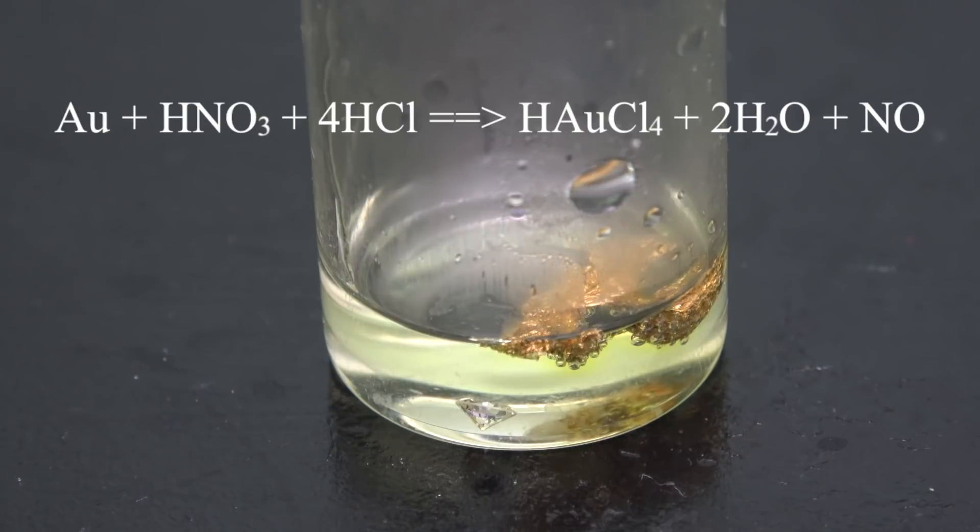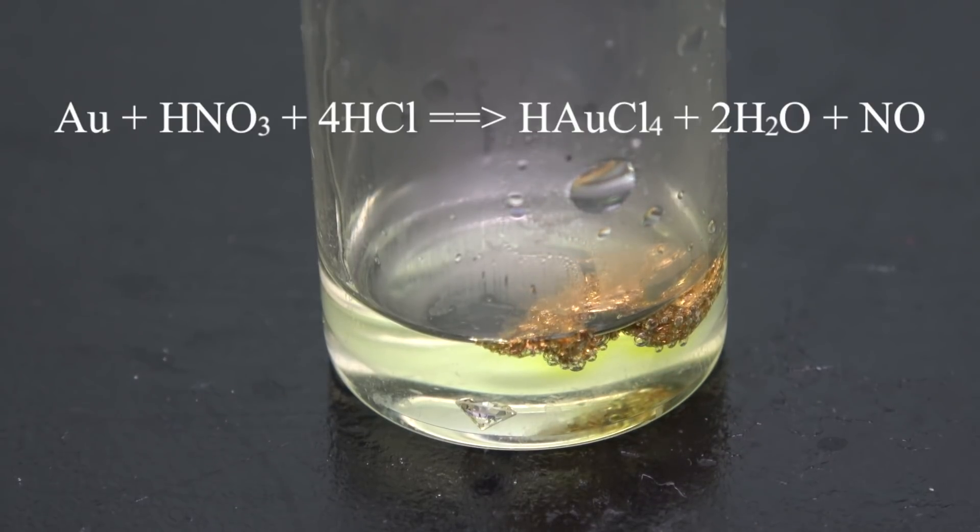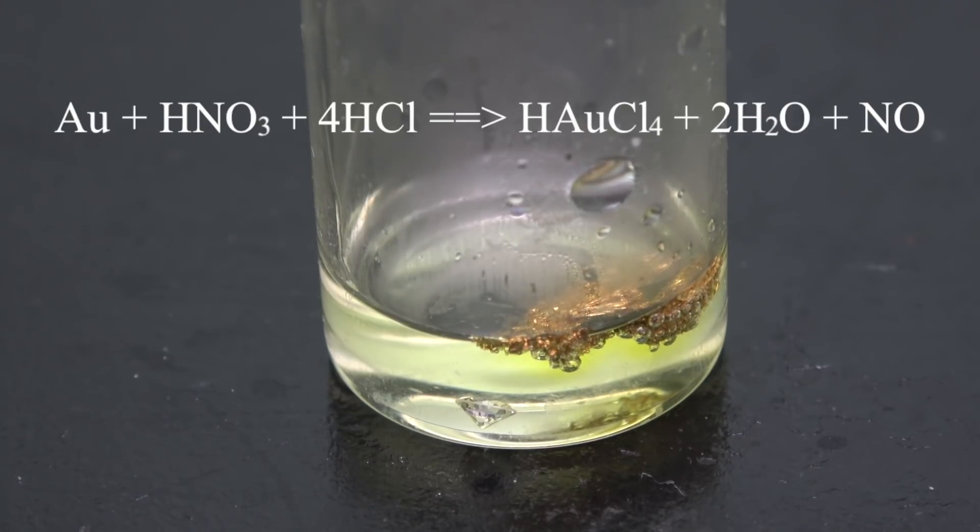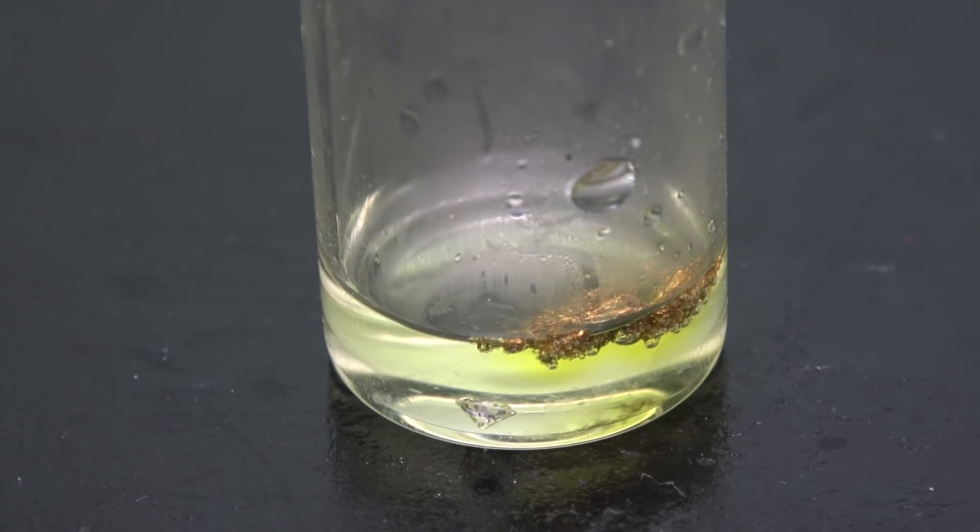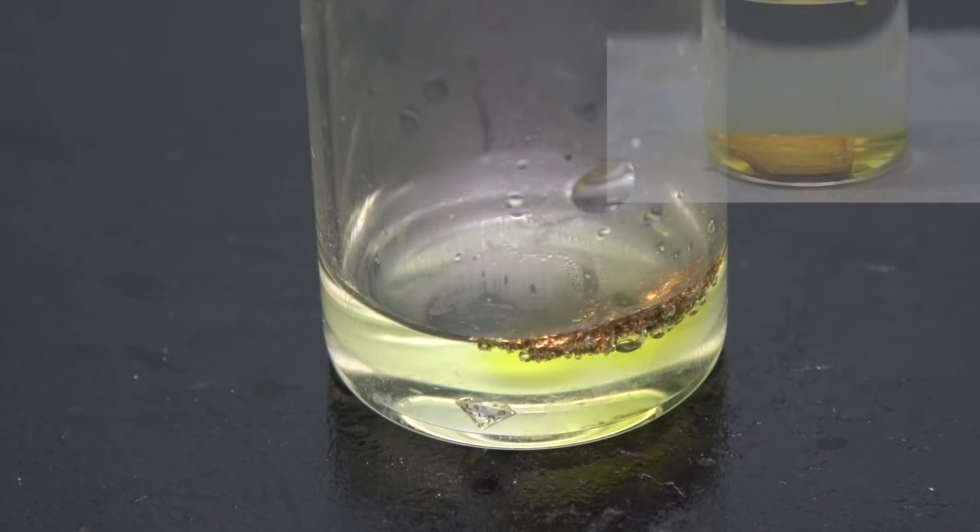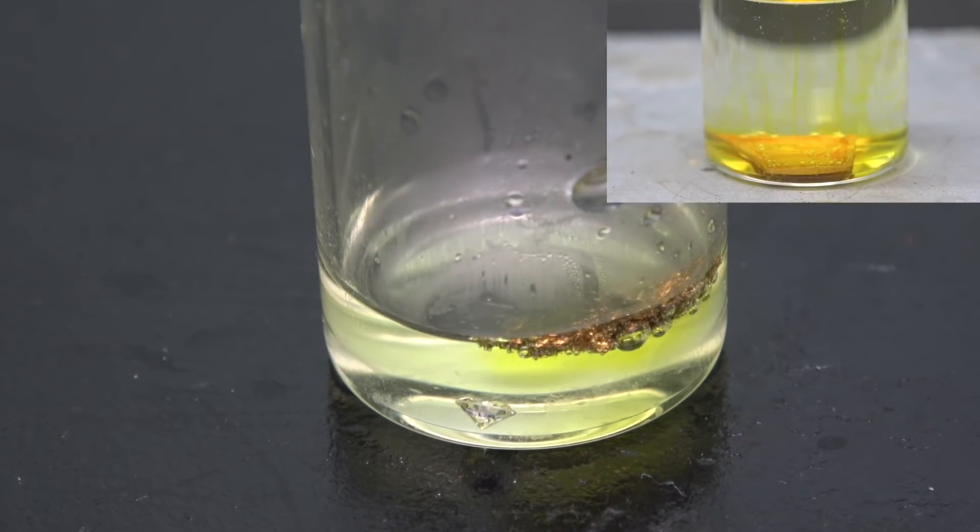Basically, the gold is reacting with hydrochloric acid and nitric acid to make chloroauric acid, along with water and nitrous monoxide. Well, what is actually happening is way more complicated than just this, but I'm not going to go into too much detail in this video. That is topic for another day.